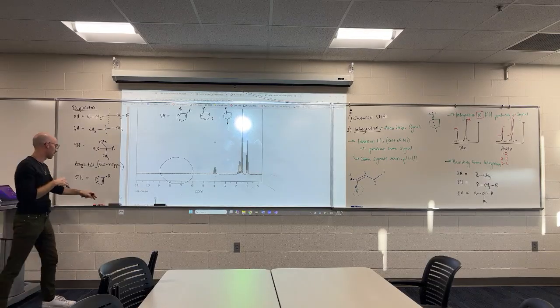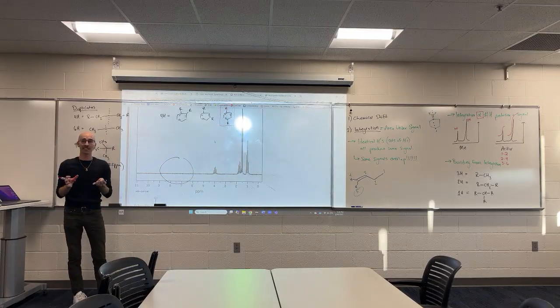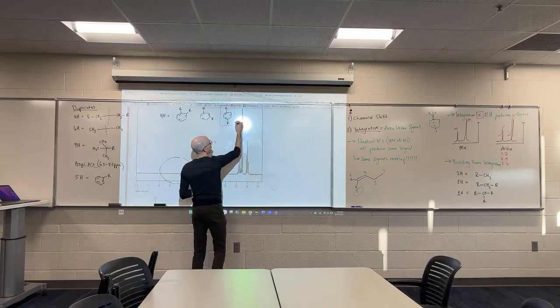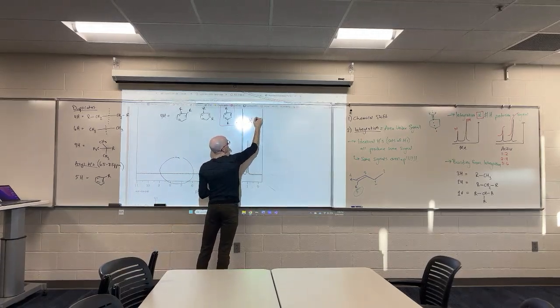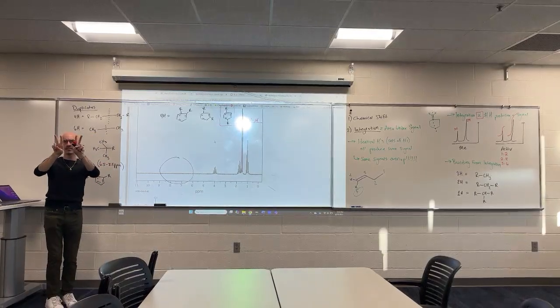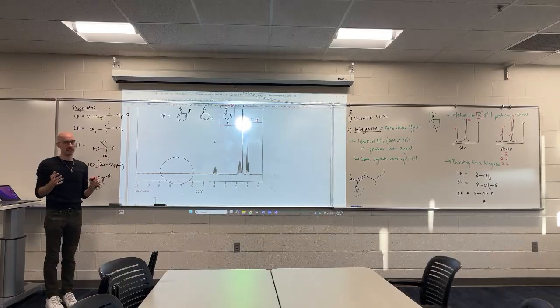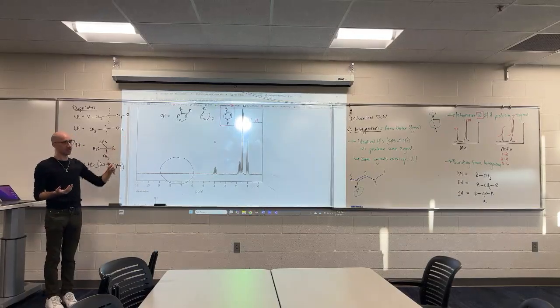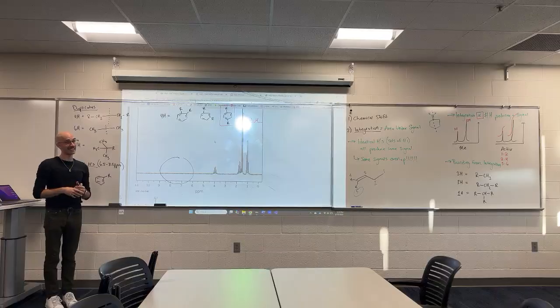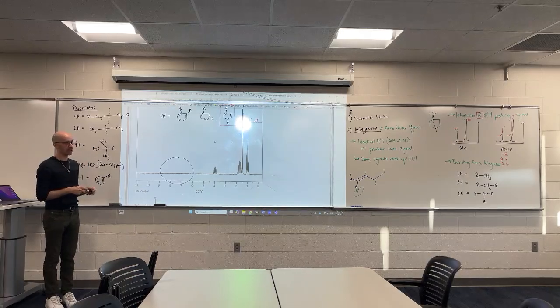The only thing I'm going to say about this is that this 1,4 substituted ring actually gives the cleanest signal. This often looks like this: 2 signals with 2 peaks each. It looks very clean. The other ones are super messy. So if you're ever in the aromatic region and you see 4 hydrogens, integration of 4, and it looks nice and clean like that, you've got that 1,4 substituted structure more than likely. The other ones are going to look super messy and hard to tell apart.